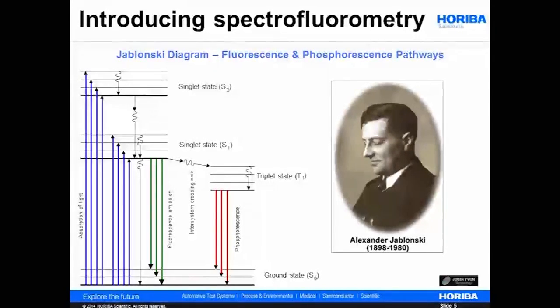A part of the absorbed energy is lost through internal conversion or heat exchange with the environment, for the sample to go down to a lower excited electronic state. The final step of the process is to get back to the ground, non-excited state, which is the most probable state for a molecule in the absence of an external source of excitation, in green on the picture. This last step is accomplished by releasing the excess energy in the form of light, making the phenomenon of fluorescence.